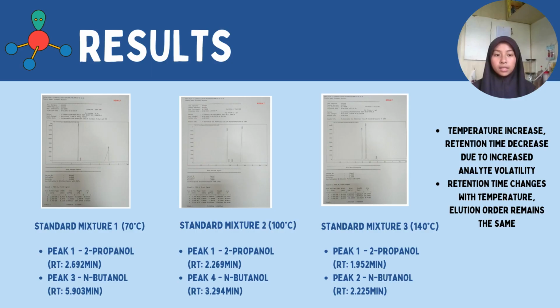This result indicates that when temperature increases, retention time will decrease due to increased analyte volatility. And the retention time will change with temperature, but the elution order will remain the same.